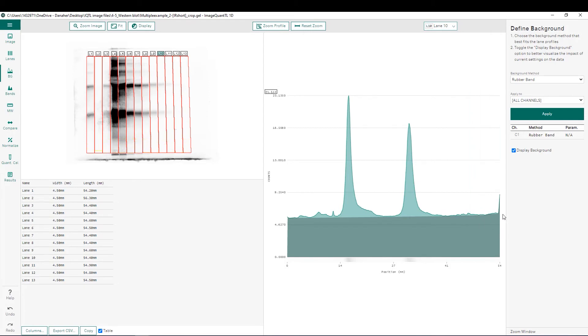Rubber band background is most beneficial when you're looking at Coomassie gels that can have a variable background between the top and the bottom of the lane. This allows us to contour around those points and give us a localized background for each individual band.